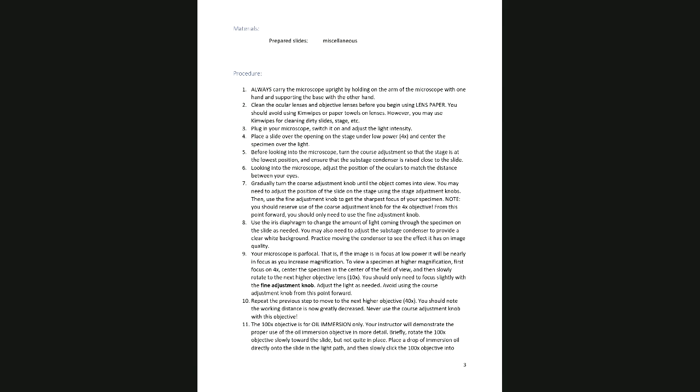When you're on the high dry, now you use the fine focus only. And when it comes to the fine focus, because it's fine, you should only ever turn the knob a few turns in one direction or the other, because you should be very nearly there. You should be close. So you don't have to turn the fine focus knob that much.